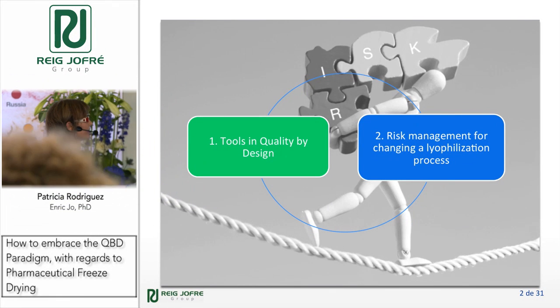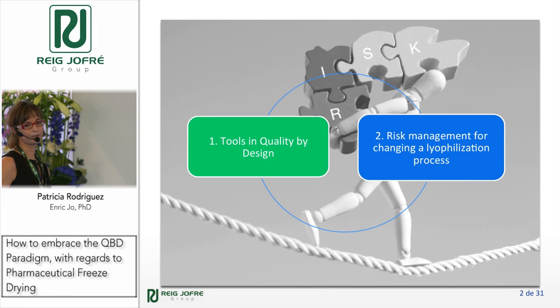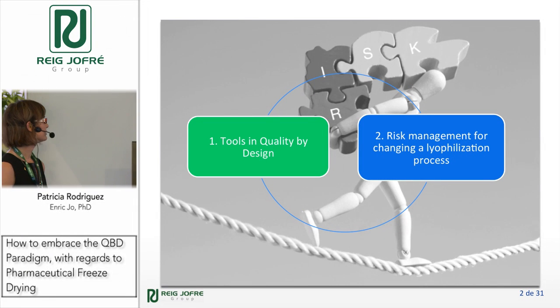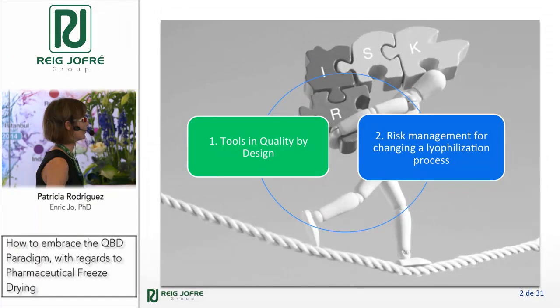Well, first, I divide my presentation in two main parts. First, I'd like to give you a brief overview about tools in quality by design. And then I'm going to show you a case study where we are talking about the risk management for changing a lyophilization process, right? So let's go.